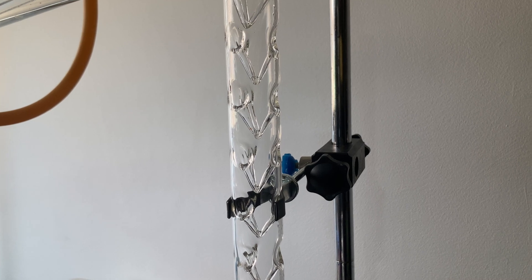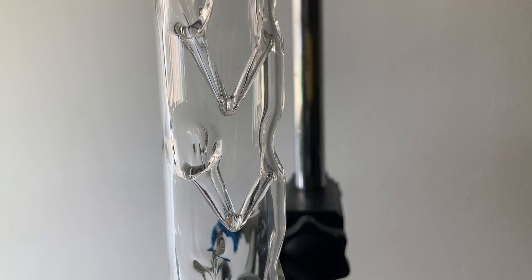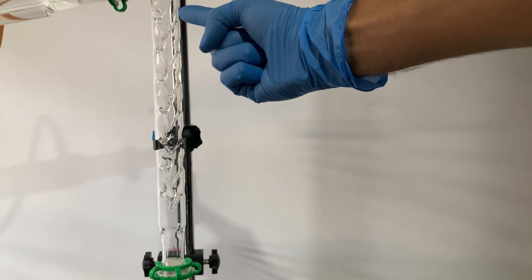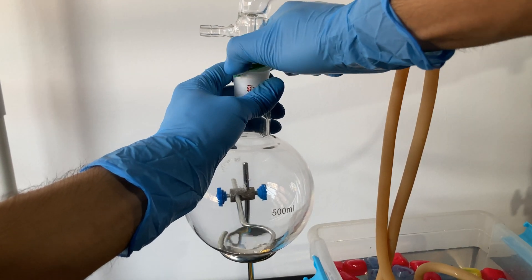And that's exactly what a fractional column does. The fractional column is a glass tube with a bunch of spikes in it. Although not all fractional columns look the same, they all share the same principle. Inside the column, the mixture condenses when it touches the spikes, because they are at a lower temperature. At the same time, the vapor tries to reach the top of the column and gets in contact with the condensed phase. This causes the condensed phase to boil again, just to condense again when it reaches the spikes further along the column. The process repeats all over the column, meaning the mixture condenses and boils several times as it travels through - that is like doing several distillations. Therefore, a fractional column emulates the effect of several distillations in just one piece of equipment, and because of that, the vapor that reaches the top is more pure.